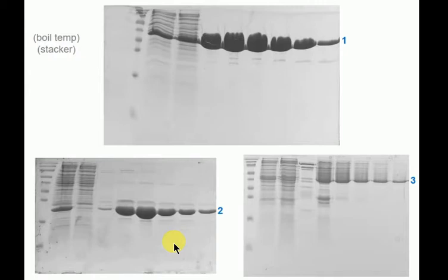So for example, in example number 2, look, my protein's the dominant protein. I can purify it almost straight away. You got a little feather here. Not really sure what that is, but it's essentially pure. Whereas with example number 3, I'm less dominant. That band's starting out in the raw cell lysate. That band's less dominant, and I have a harder time of purifying it, basically.